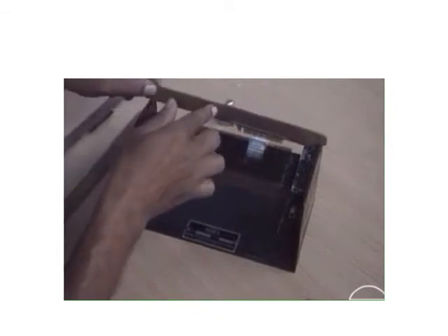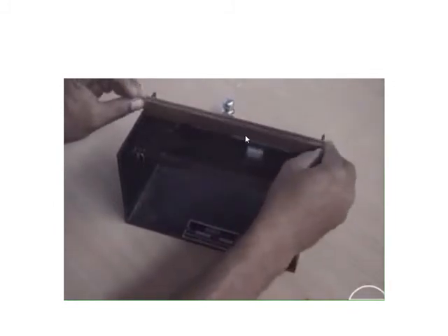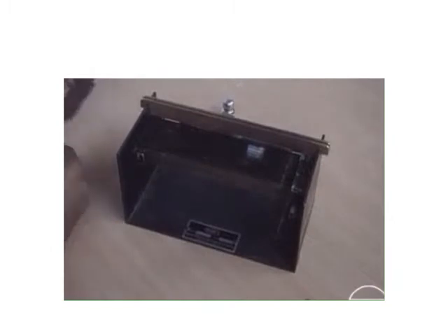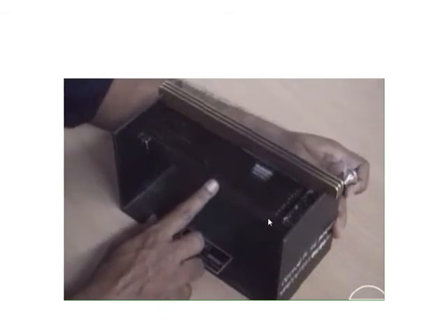Now turn the instrument such that the front of the instrument faces the operator. Then place the top combs. 3 top combs are placed in their positions in the grooves such that the needles are on the fibers. Because the top comb does not have the needles throughout, you place it such that it is there. After placing all the top combs like this one by one, slowly the bottom combs are depressed one by one.